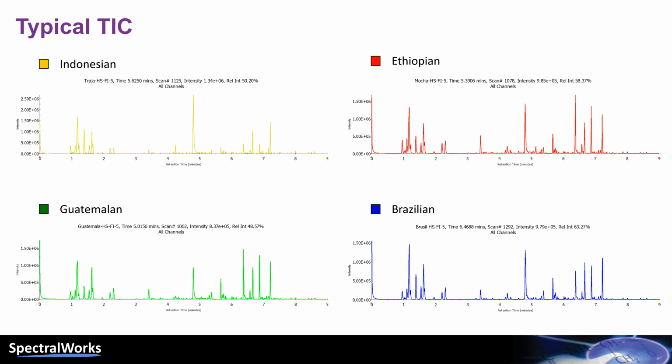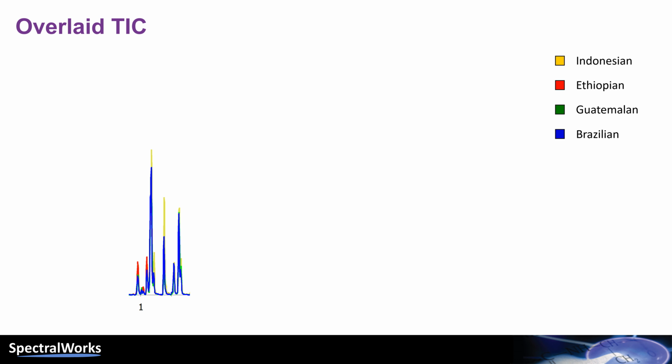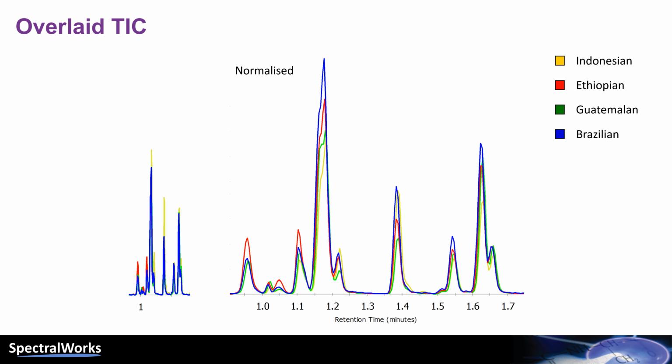Although there are some visual differences between each of the chromatograms, those differences are particularly subtle. In fact, when you overlay the chromatograms, you would probably see that there are more similarities than differences. I am sure you can see some subjective differences between each of the chromatograms, but it is very difficult to try and objectively describe these differences. Different users might describe the subtle differences between the chromatograms in different ways. Clearly, a consistent and objective approach is required.